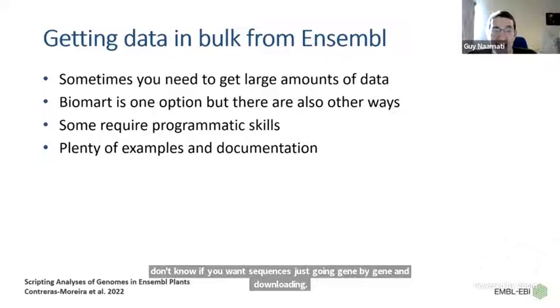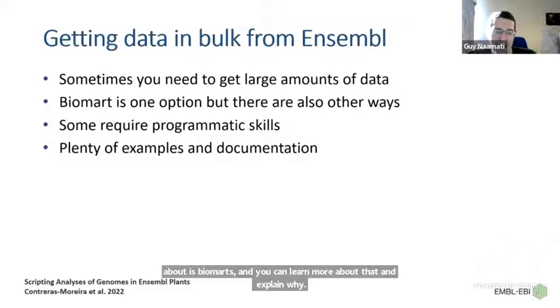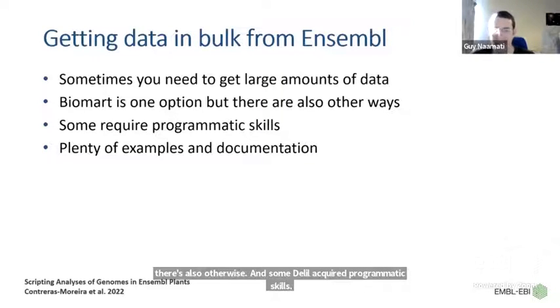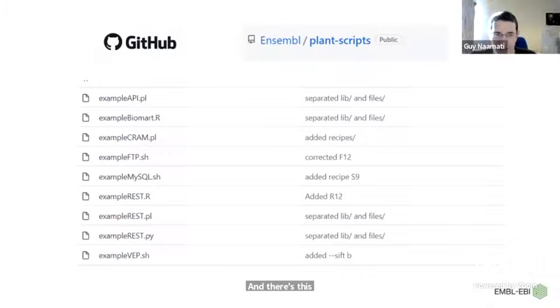One thing I haven't talked about is BioMart, and you can learn more about that, but there are also other ways, and some do require programmatic skills. So if you're into programming, that can be very useful for you. And the good thing is there are plenty of examples and documentation. There's also a book chapter which we published last year about how to get that.